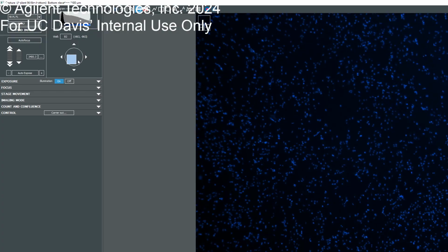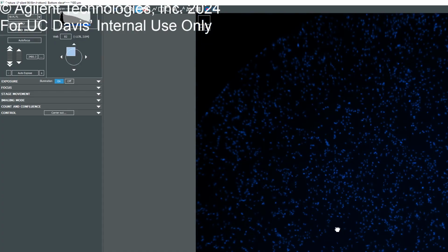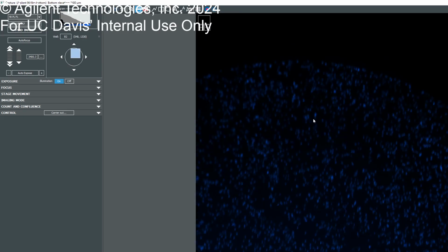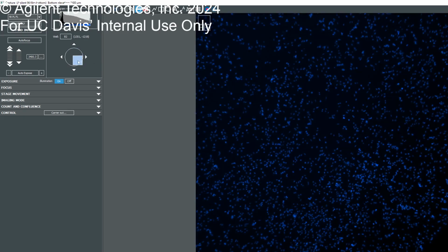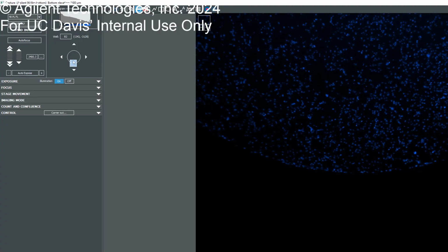Or you can also just click anywhere within the well. Or you can also just click and drag. So there are multiple ways of doing the same thing, essentially, to go to the spot you want to go to. I'll try to click this and I'll end up clicking the bottom and I'll ruin my whole thing and have to restart. What's that? My camera. The arrows are so close to the circles sometimes. Oh yeah, I ruin my whole thing pretty frequently.